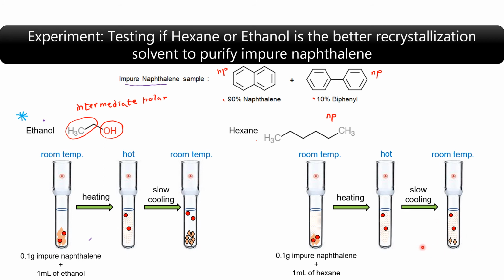There might be a lower amount of crystallization occurring once they are already made to be solubilized. So based on the polar-nonpolar characteristics of these molecules, these are the observations that we hope to see during the experiment.